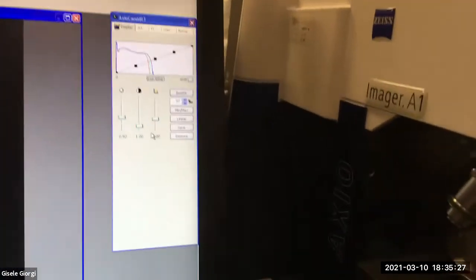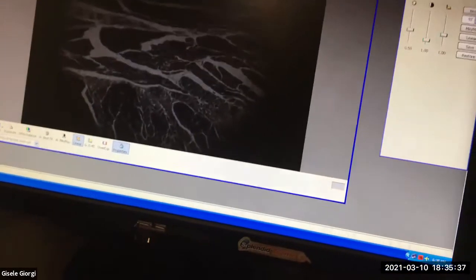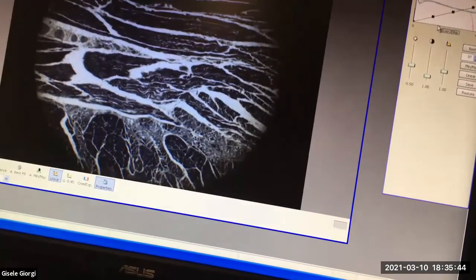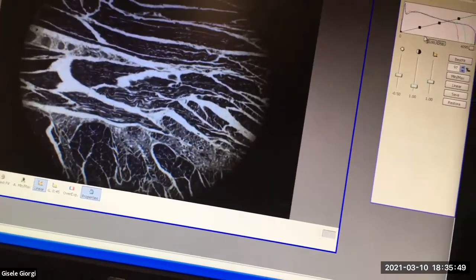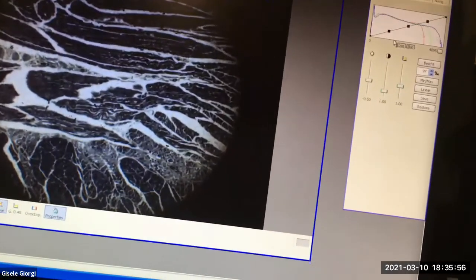Okay. I just fixed it a little bit. Notice the dynamic range is terrible. Yes, we agree. Look at the image. I'm like, that's no good. Let me just focus it a second and give it a little more light. So let me see. It's just playing around. Again, I'm not sure why it's only showing me this circle. That's really unusual, but hopefully will it work with the iris diaphragm? Yeah, you can sort of see what it's doing.